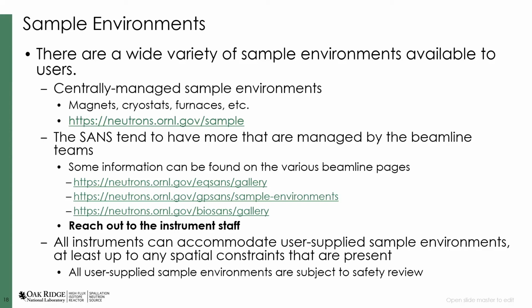And I do want to reiterate that any of these instruments can accommodate your user-supplied sample environments as long as they'll fit and as long as the safety people say it's okay to use them. So if you bring something in, your sample environment will be subjected to the standard safety reviews that everybody goes through. That includes an electrical safety review for user-developed equipment that doesn't have UL listing or similar listings. But we're happy to work with you. We'd love to hear your ideas, and we'd love to have you here to do your own interesting science.